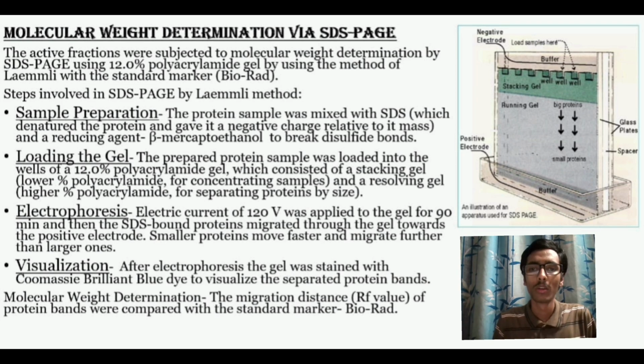In this way, the protein molecules are not separated based on the charge in the stacking gel. While moving through the resolving gel, the pH changes from 6.8 to 8.8. Due to this change in pH, the glycine molecules become more negatively charged. Hence the glycine molecules go ahead of the SDS protein complex in the band. So now the new band formation is as follows.